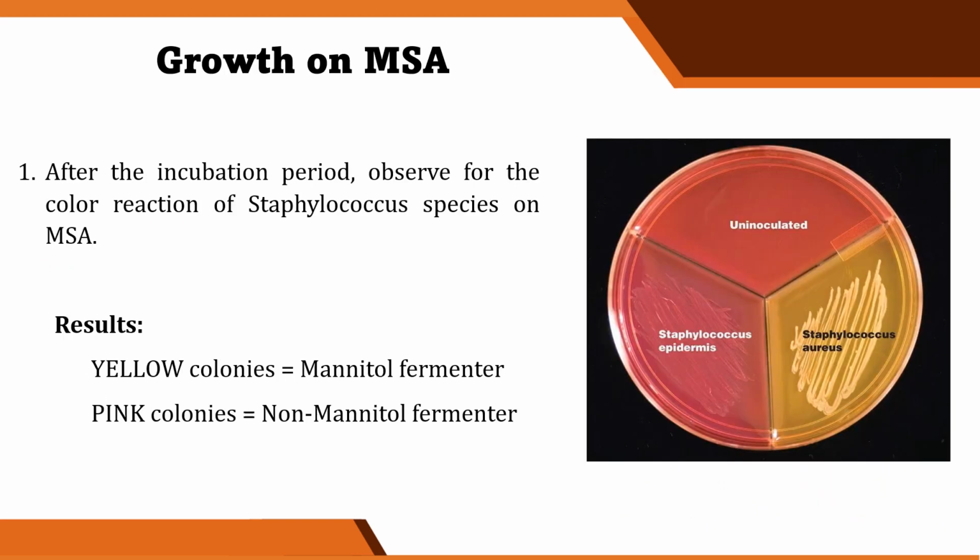Okay, so let's talk about MSA. MSA stands for mannitol salt agar. Okay, so this is a type of differential media na ginagamit natin for differentiating Staphylococcus species. Okay?